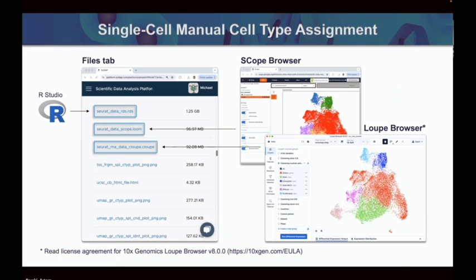Okay, any questions? Yes, I had a question. It sounds like you're using a mix of R. I guess on the back end, is it R, Python, both, everything? Depends on the pipeline. Everything that is related to single cell was written in R. But for bulk RNA, bulk ATAC-Seq, like the first part of the slides, it could be any other application.